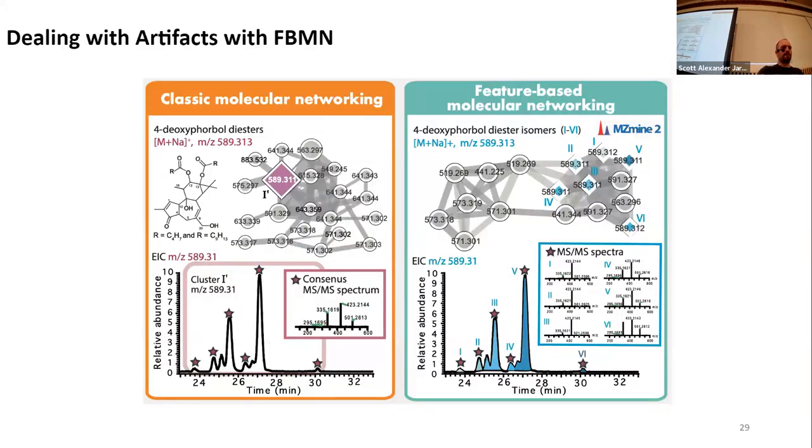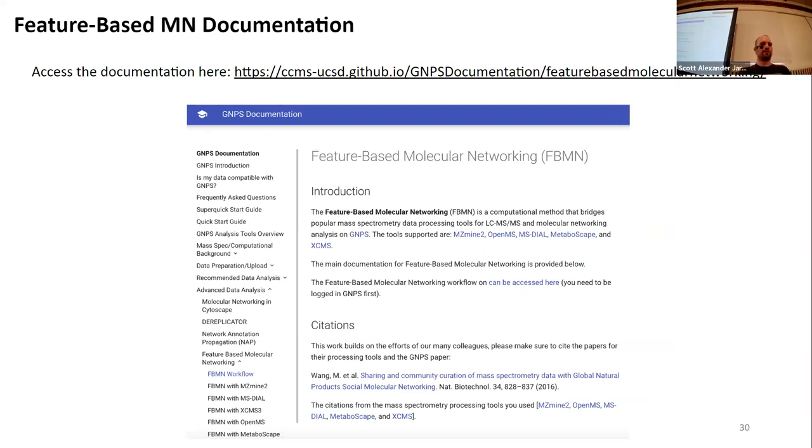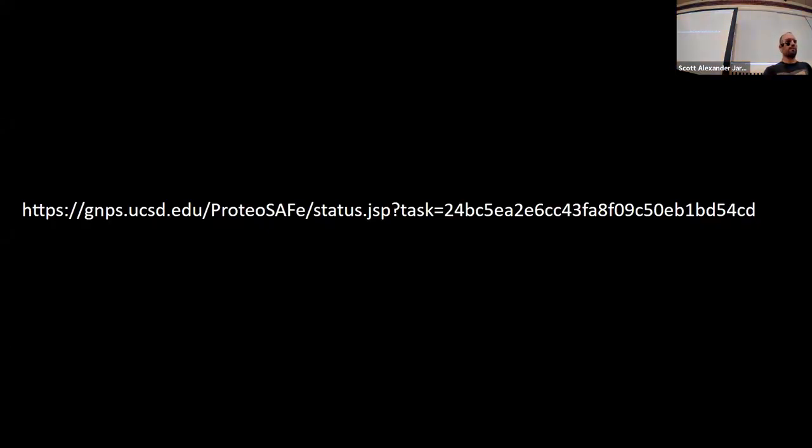All right, I think I've talked enough about the differences. Very importantly, we have extensive documentation online. If you're on this GNPS site, there's a documentation button at the top. A lot of people spent a lot of time writing detailed documentation for all the different workflows. So if you get lost, feel free to take a look in there as well. And hopefully it's easy enough to guide you through the analysis, even without the workshop or the recordings later. And I think that's pretty much it.